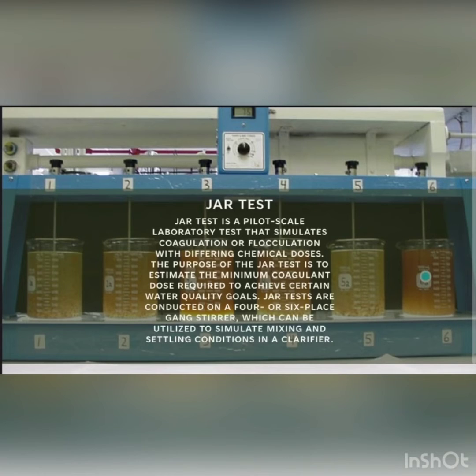Jar test is a pilot scale laboratory test that simulates coagulation or flocculation with differing chemical doses. The purpose of the jar test is to estimate the minimum coagulant dose required to achieve certain water quality goals. Jar tests are conducted on a 4 or 6 place gang stirrer, which can be utilized to simulate mixing and settling conditions in a clarifier. Next, we move to the objective.